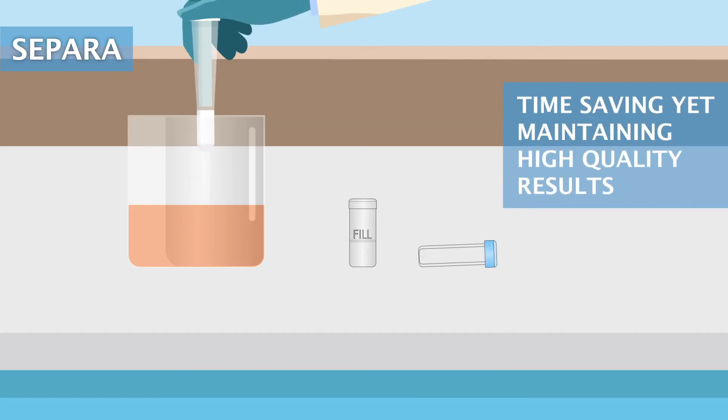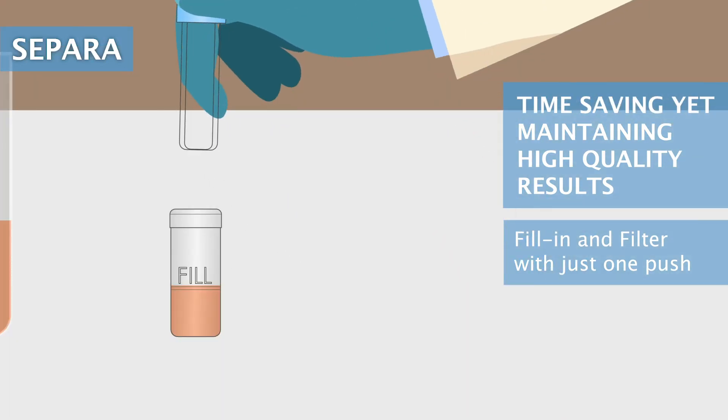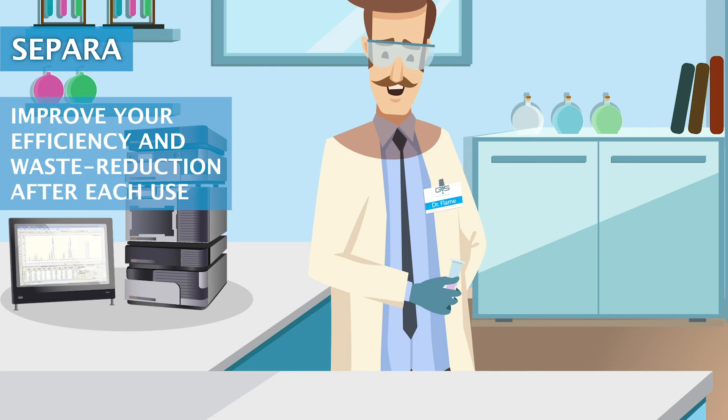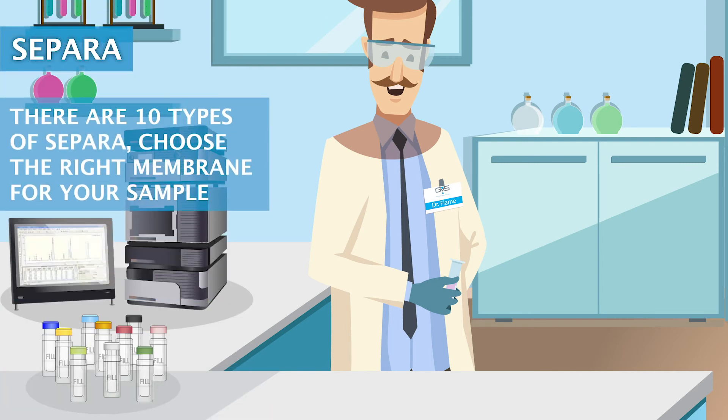Time-saving yet maintaining high-quality results. Fill in and filter with just one push. Improve your efficiency and waste reduction after each use — reduce your waste by 80%. There are 10 types of SEPARA.